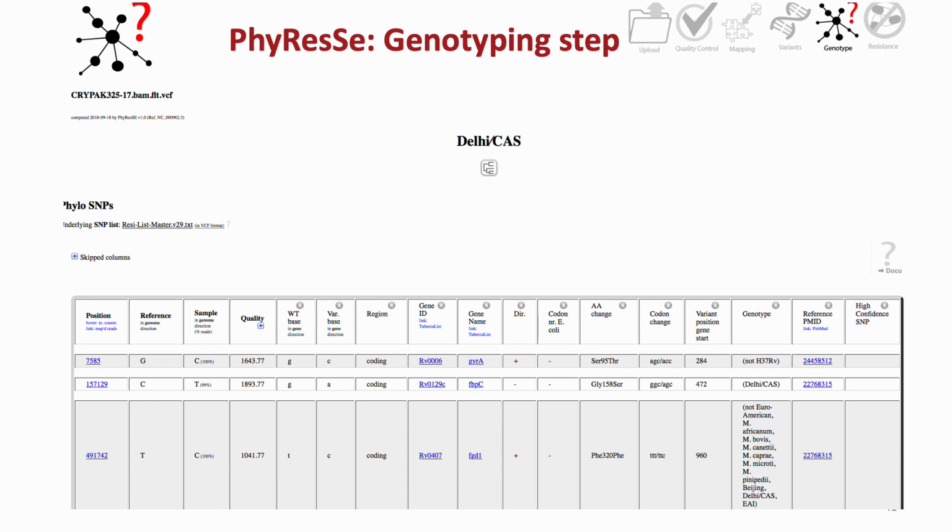So by this tool, by TB-Profiler, and by Microbe, we can have information on drug resistance and genotyping of our samples. These tools are free to use and user-friendly, and can be the first step for you as microbiologists, biologists, and laboratory personnel to start, step by step, doing the analysis of your sequence data.